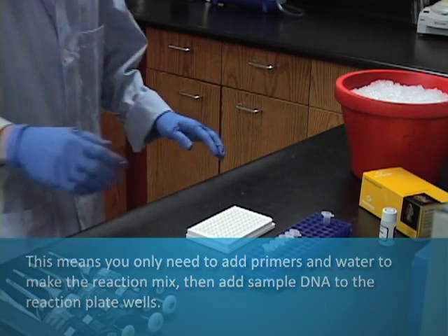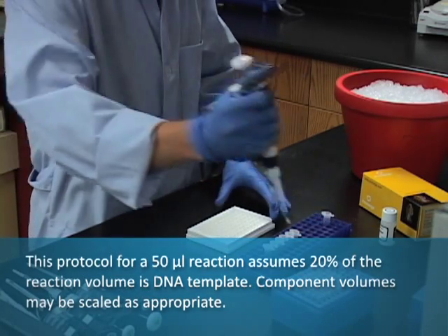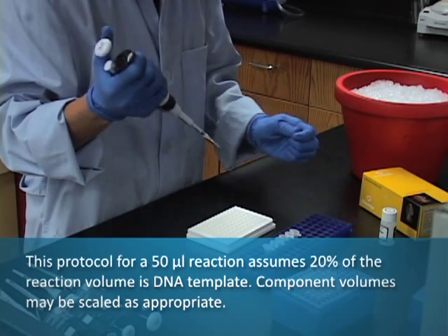This protocol for a 50 microliter reaction assumes 20 percent of the reaction volume is DNA template. Component volumes may be scaled as appropriate.